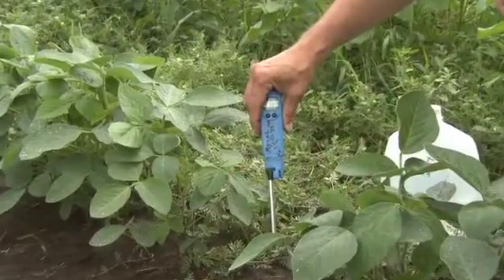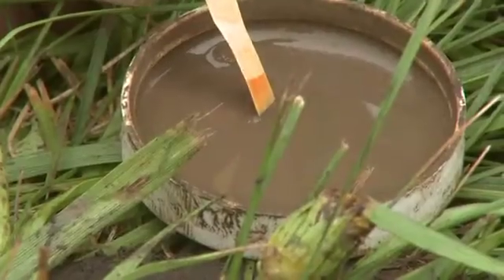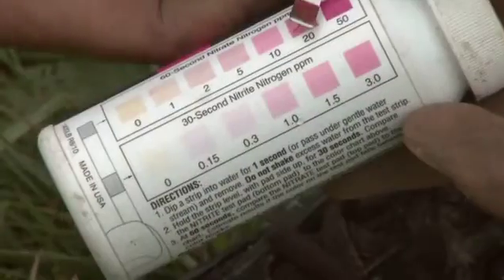When we're sampling our soils, you're going to be sampling them primarily for the organic matter test, the EC (electroconductivity) test, the pH test, the phosphate test, and the nitrate test.